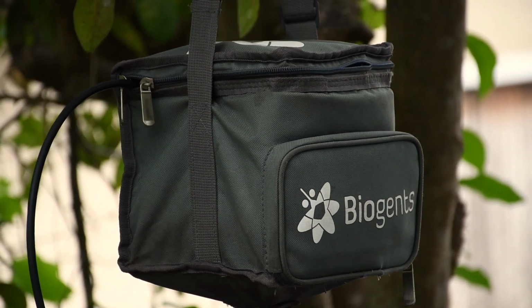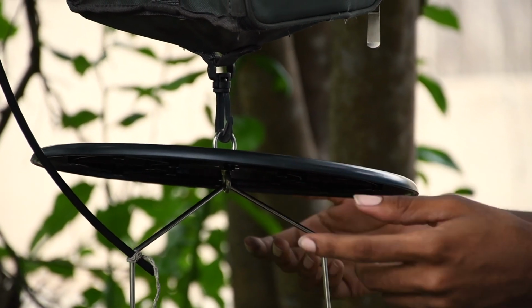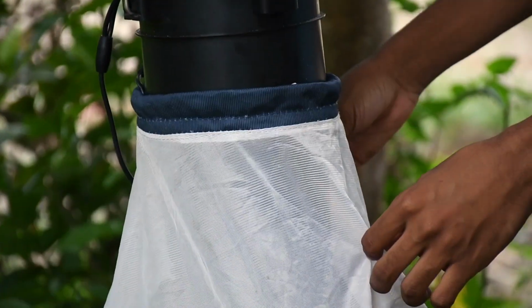We also have the rain shield that protects the trap from rain during rainy seasons. We also have the net right here, which we use to store the mosquito attractant or the BG lure. We also have a tiny small net inside the trap that keeps the mosquitoes trapped.